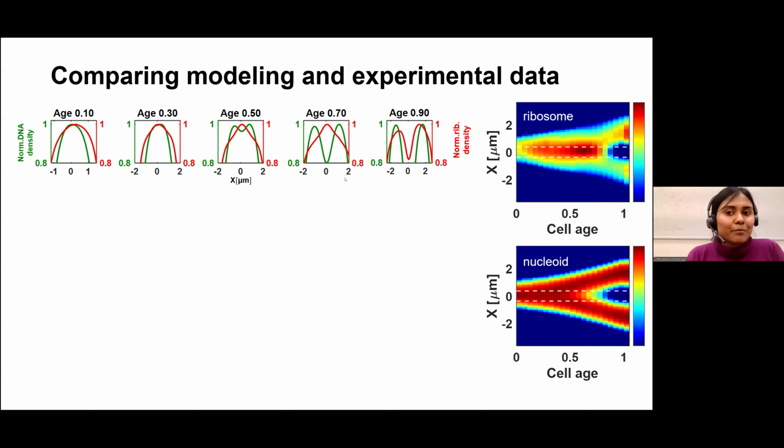So these are different time points in the cell cycle. And at point 3, you can see both ribosomes and nucleoid signals kind of overlap with one another.